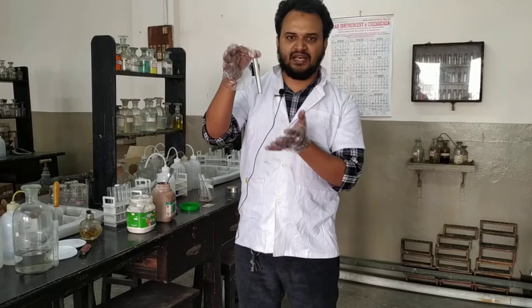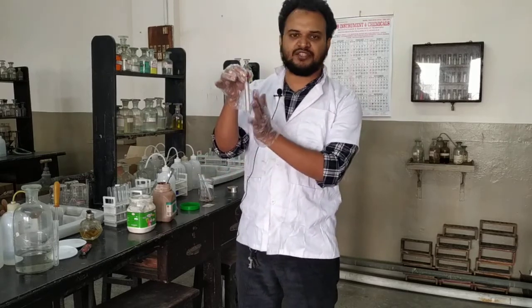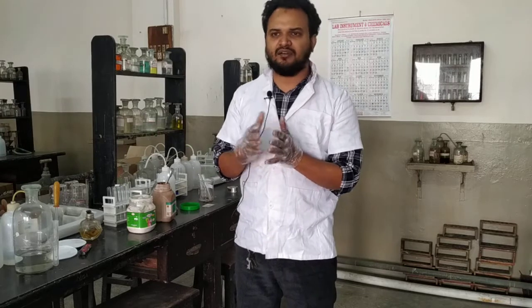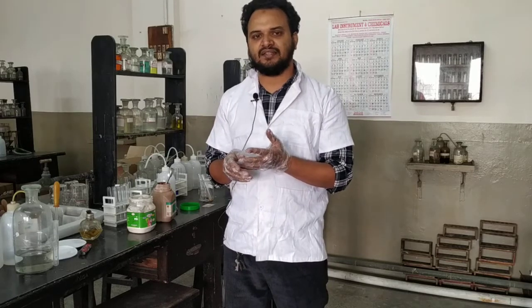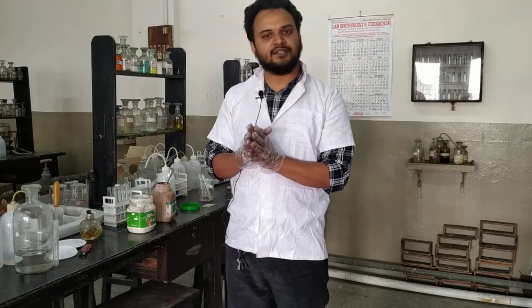This is my Tollen's reagent. I have just prepared it only a few minutes earlier. So I will use this freshly prepared Tollen's reagent. In your practical exam at class 12 level, this will be supplied. However, in higher classes, when you are about to use the Tollen's test at graduation level, it is always better to prepare a fresh Tollen's reagent by yourself.